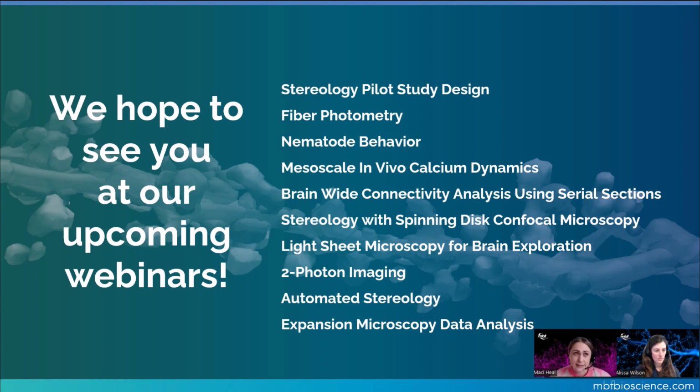In addition to that, we have added a user-guided method, the interactive tracing, where we trained a machine learning model to also address that issue. It will interactively close or fill in the lumen as it's tracing, or recognize that it should be filled. Using machine learning, we are hoping to make it even easier for you to do accurate tracing on that data.